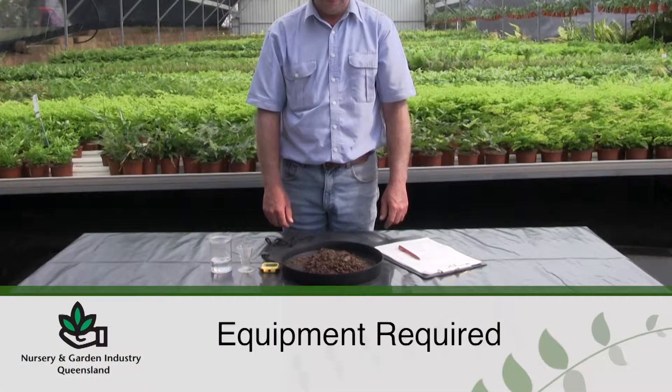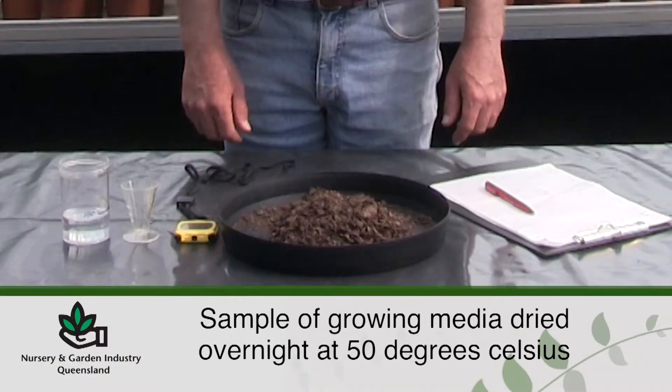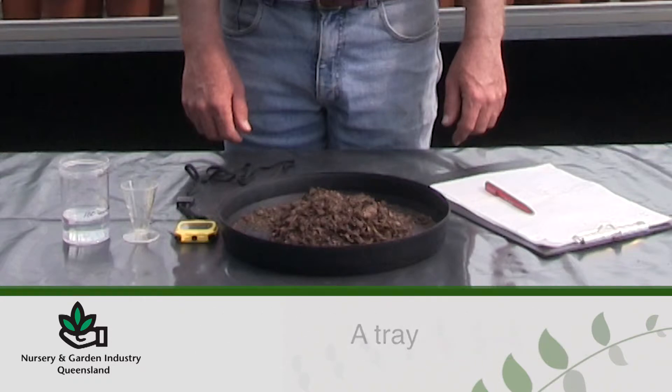The equipment required for a wetability test is a sample of growing media dried overnight at 50 degrees Celsius, a tray, a measuring cylinder, water, a stopwatch, and record sheets.